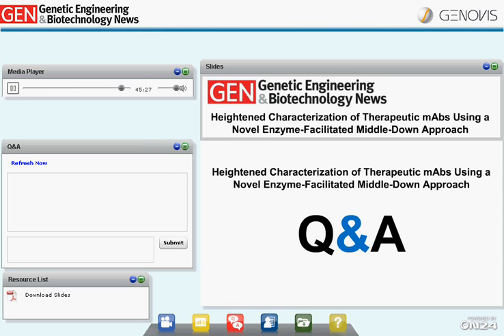All right, and can the immobilized FabRICATOR resin be used in a larger scale setup, for example, gram scale, let's say a few hundred grams even? Yeah, sure. We have done some work on that in-house as well, where we have used the immobilized enzyme to fragment large amounts in an ÄKTA system, where we just pump the antibodies through the column and receive the fragmented antibodies, and then we can do purification of the individual fragments.